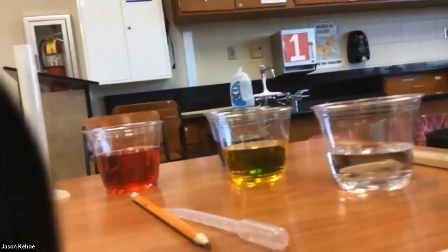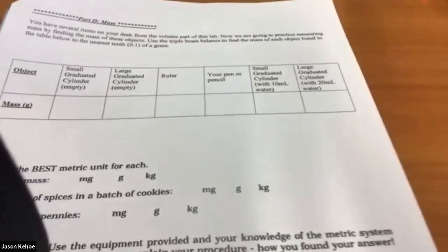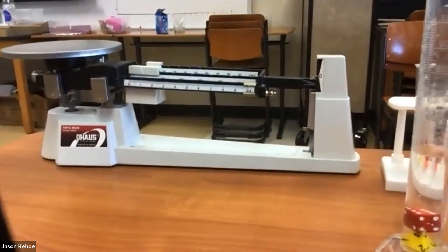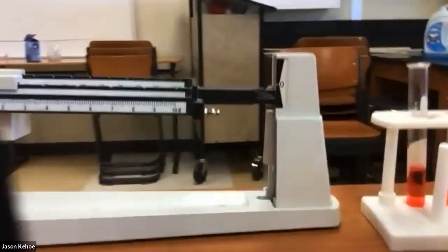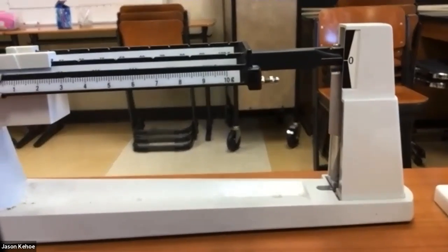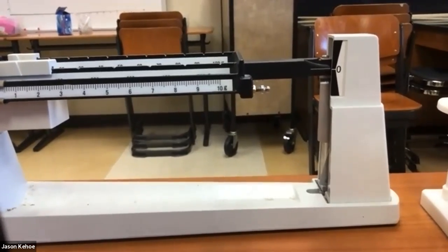And finally, part D is going to have us practice measuring mass. So we have, let's see, 1, 2, 3, 4, 5, 6 items we're going to measure the mass of. We'll be using our triple beam balance to do that. So first, let me make sure everything's set to 0. Okay. And if this was calibrated properly, when this is set to 0, that needle should point right about at that 0. That's going to be close enough for us.